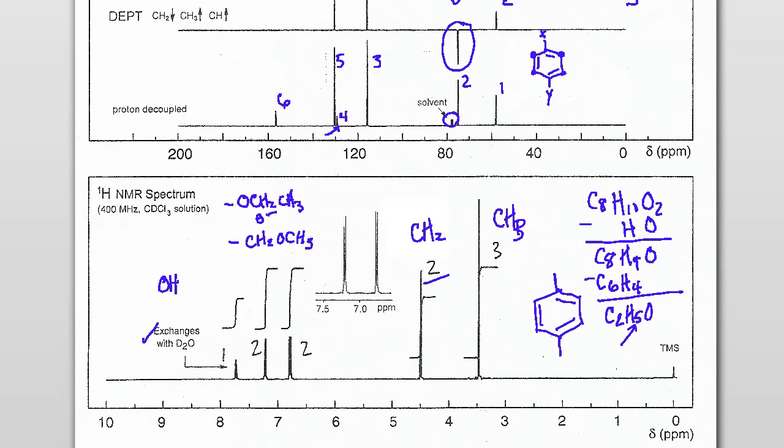Number one, we did suggest that OCH3 would be a common fragment, and you can only get that from the second option, right? The OCH3. So that was via the mass spec. Then, if you continue looking, the HNMR is what really confirms it here. So in the Proton NMR, when you look at 2 and 3, these are singlets, okay? So in the top option here, if we were to look at the splitting pattern, not the integration, but the splitting pattern, you would have a quartet for the CH2, and you would have a triplet for the CH3.